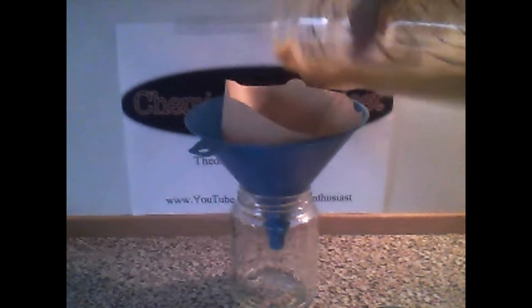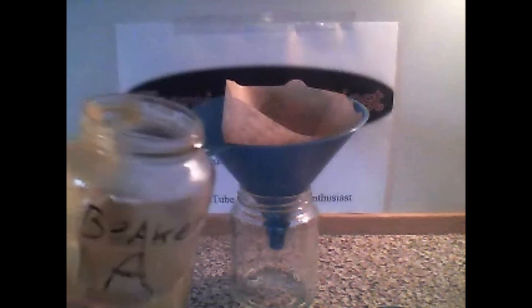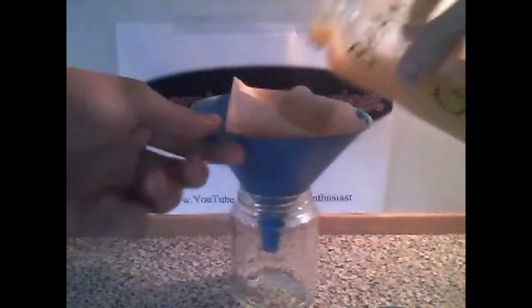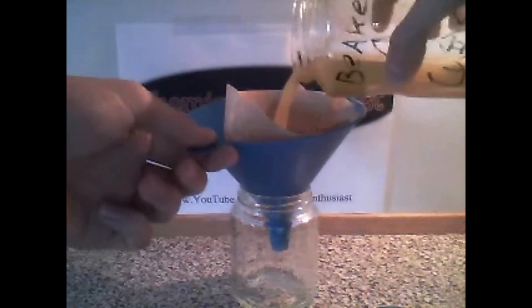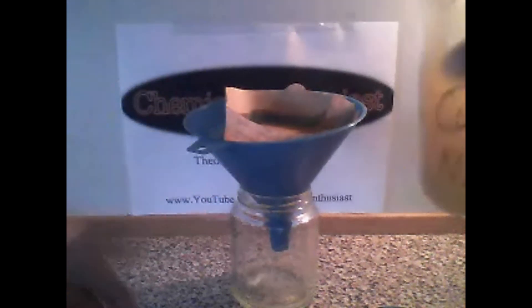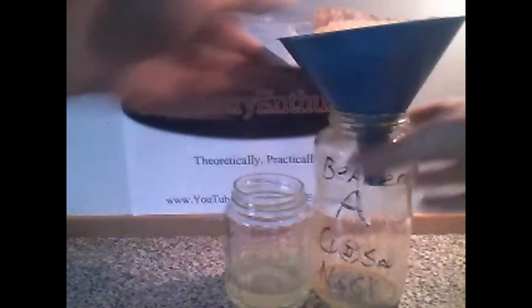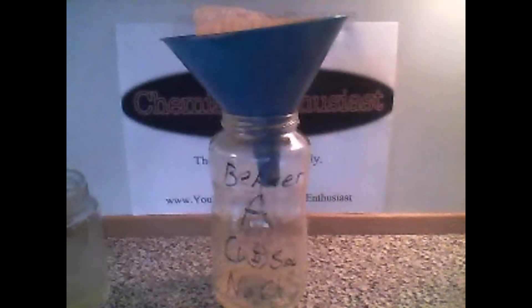When you have done that, pour the copper hydroxide and copper chloride mix into the funnel with the coffee paper. Now take some excess water to wash out the rest of the chemicals. When these are filtered through, you can wash it several times with water to improve the quality of the chemical. You can actually also wash it with ethanol, as copper chloride is also insoluble in ethanol, but I am going to leave this step out.